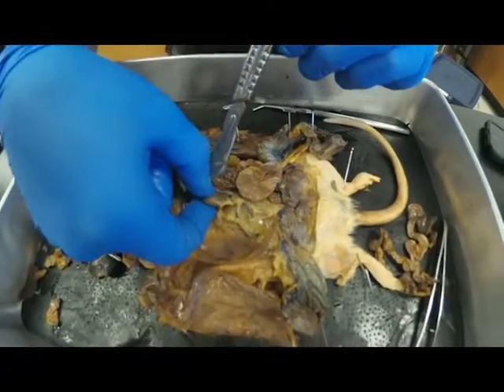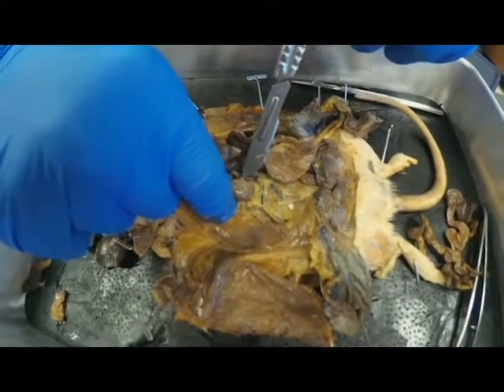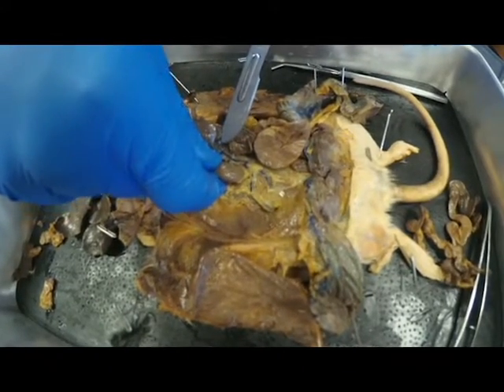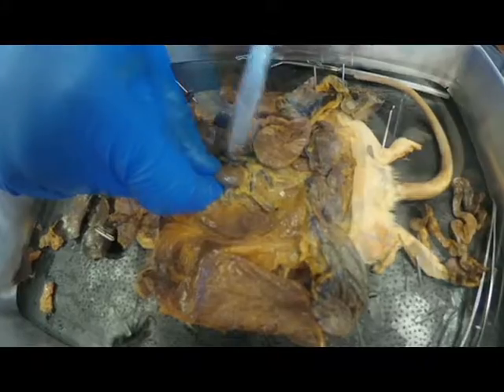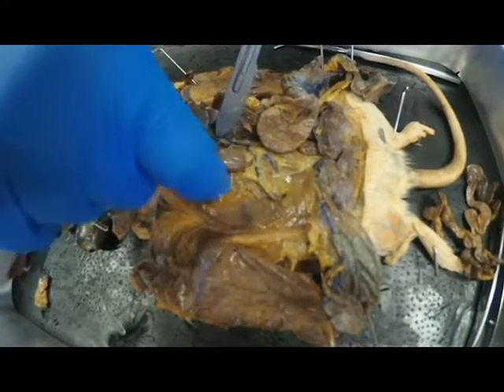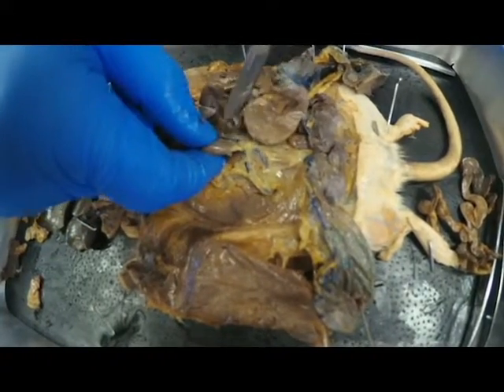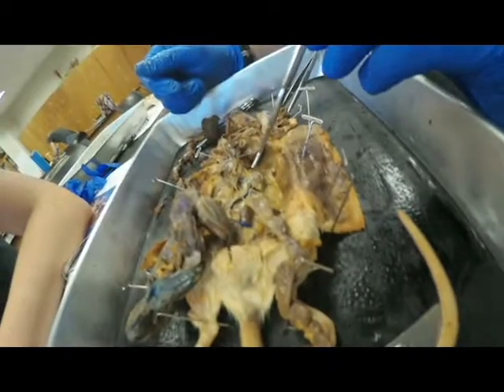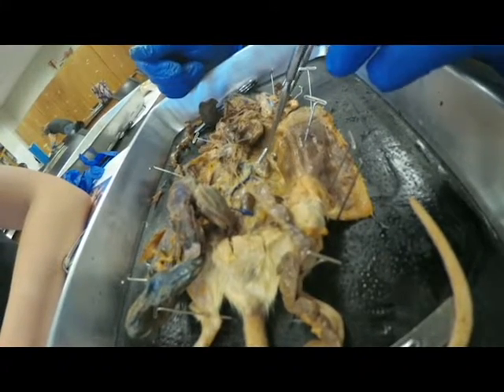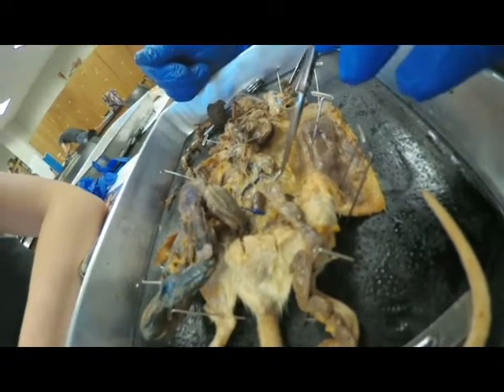Below the stomach, you'll find the kidney, which is connected directly to the bloodstream. The kidney is surrounded by fat and the adrenal gland for protection. The adrenal glands create adrenaline straight into the blood system. Inside of the kidney, it has a very fine network of veins and arteries that filter the blood constantly and remove waste. This is the other kidney on the rat's left side. It connects to the ureter, which drains the urine to the bladder.